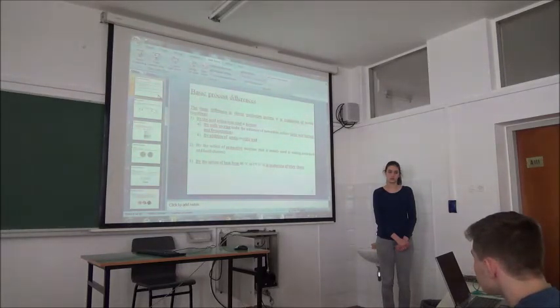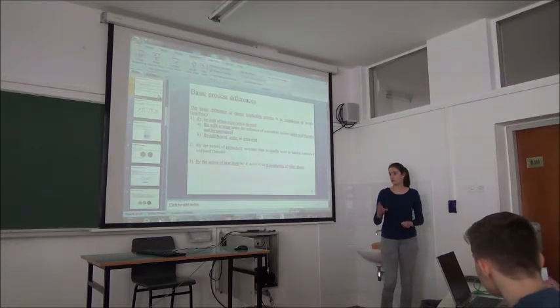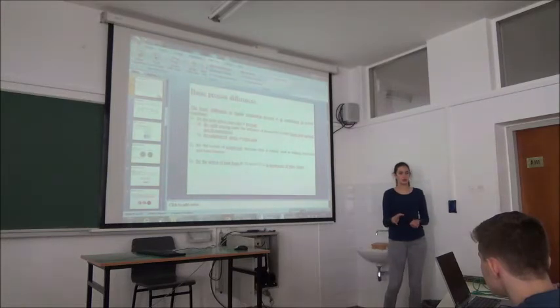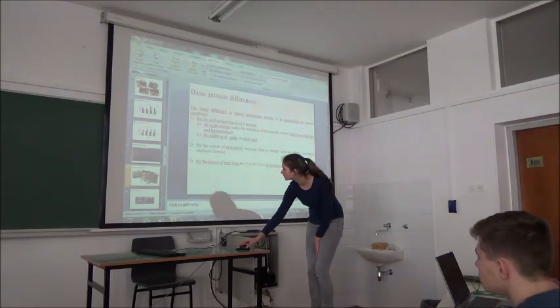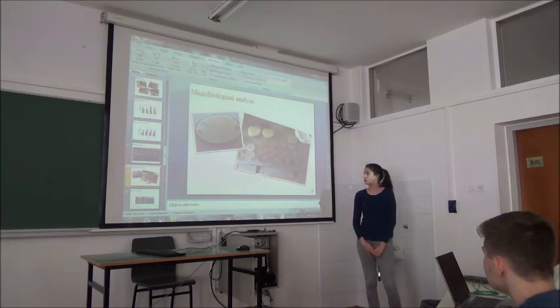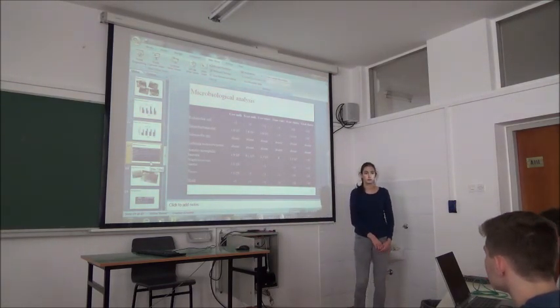How did you find out which bacteria are there? We did some microbiological analysis. We used some petri dishes and poured a solution that will grow bacteria on it, and then we put some milk or cheese or whey in, and after a few days at some temperature it will grow bacteria. Okay, can you go to slide 18? So what are the dots in the petri dishes? Those are the staphylococcus bacteria that I mentioned here. Okay. And they disappeared when we boiled the milk.